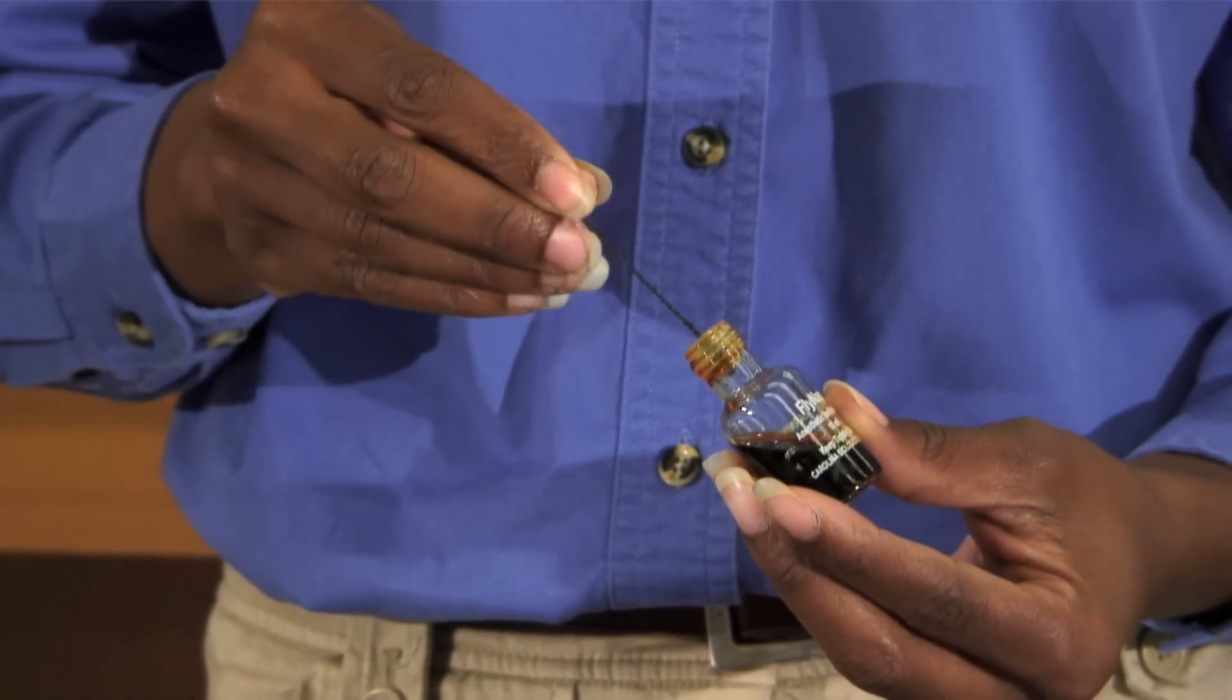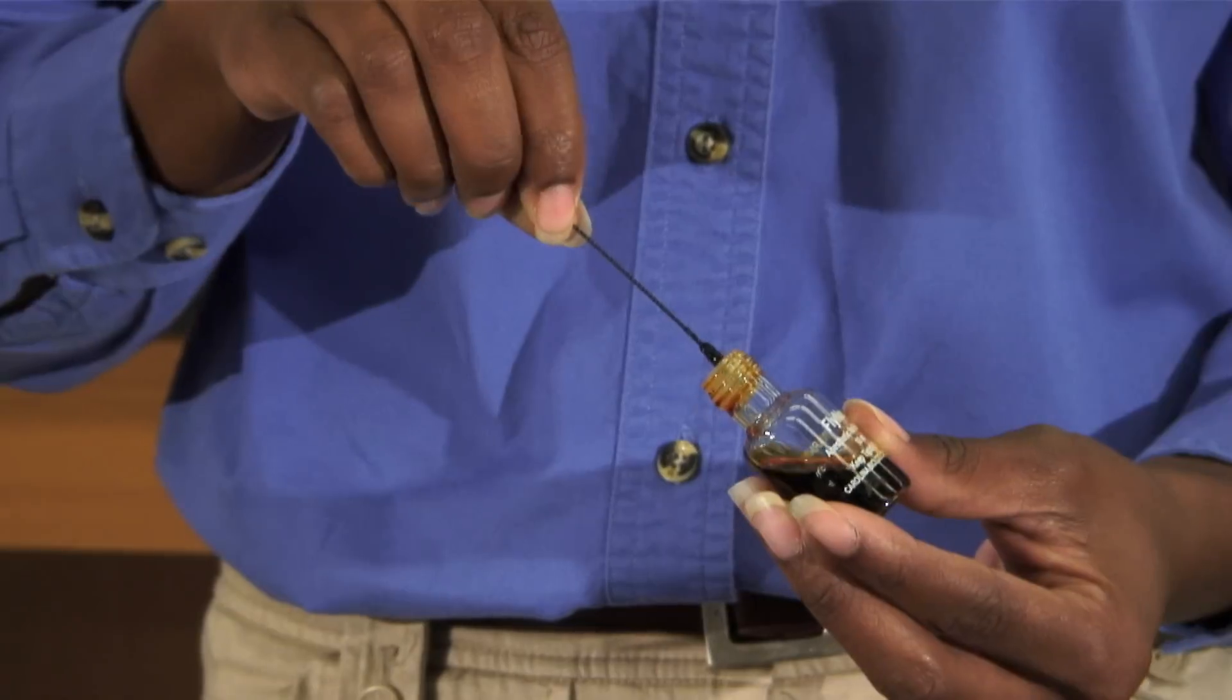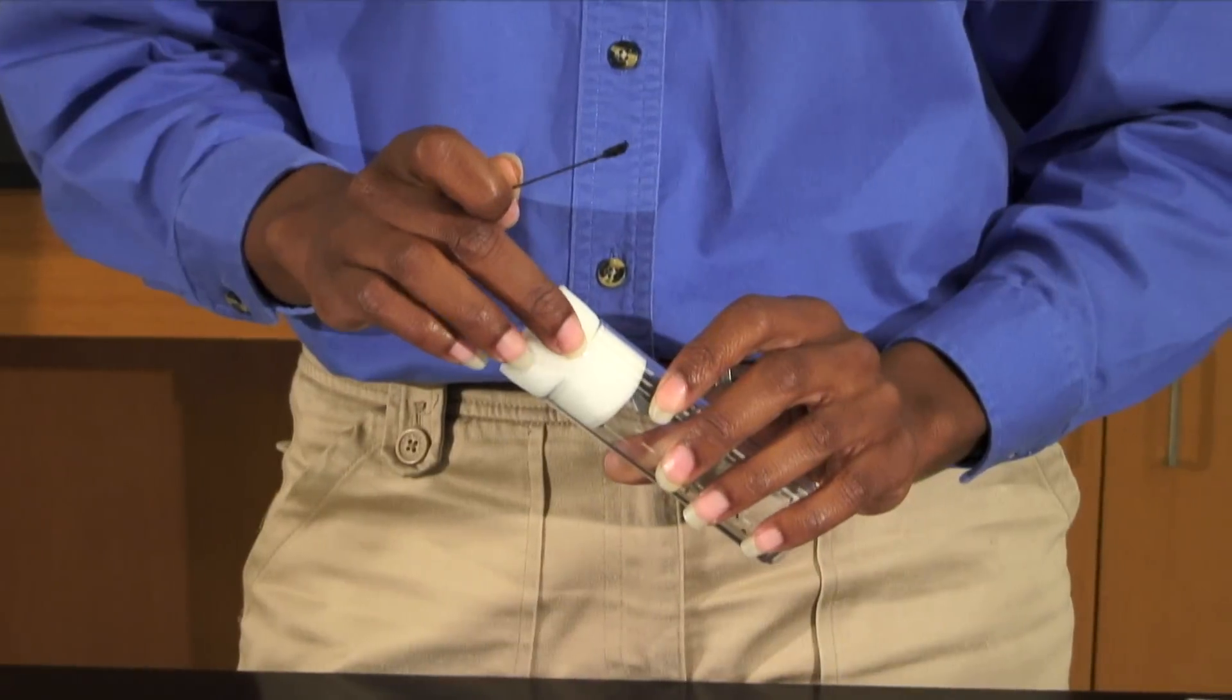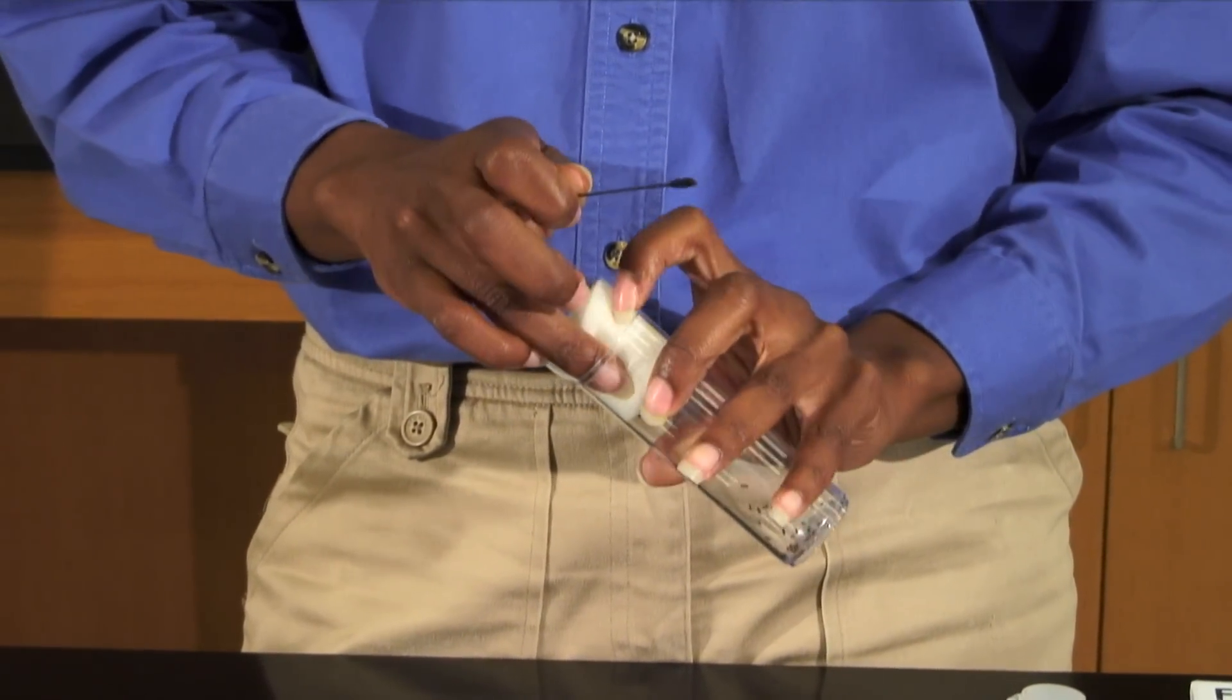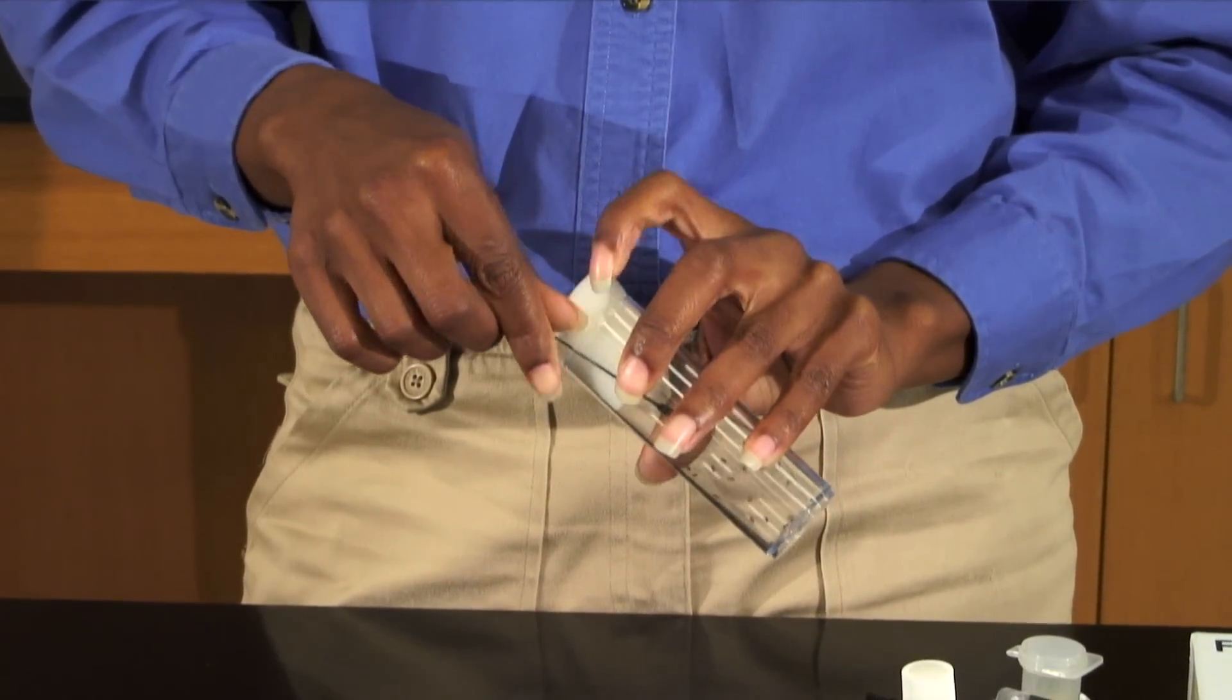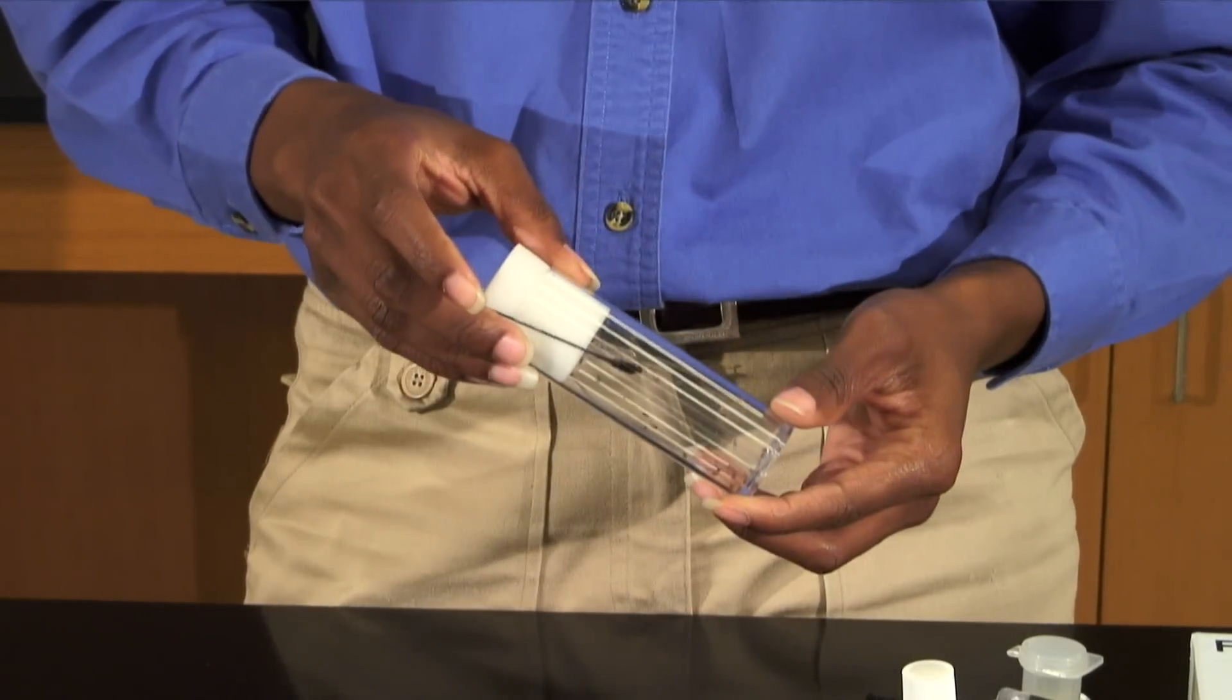Dip the absorbent end of the anesthetic wand in the FlyNap solution, making sure to remove excess liquid. Use one finger to push the plug in the anesthetizing vial slightly to one side. Quickly stick the anesthetic end of the wand into the vial.